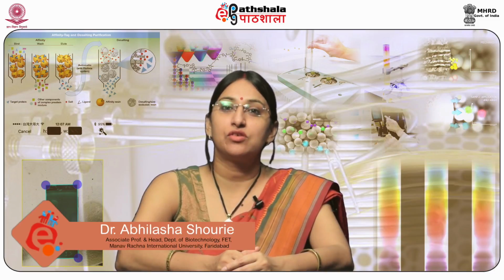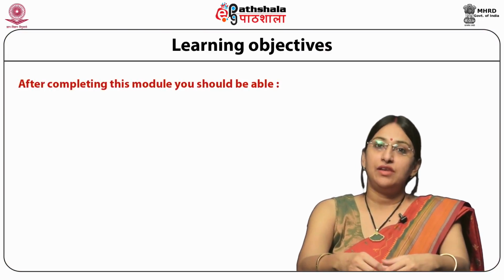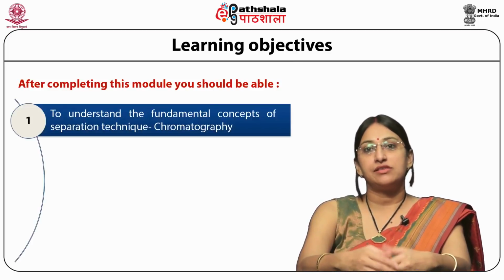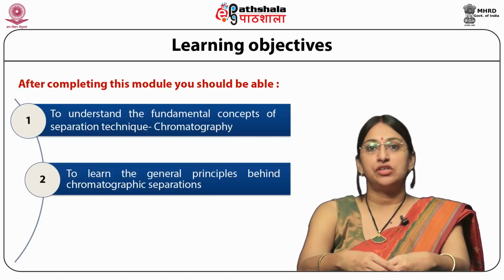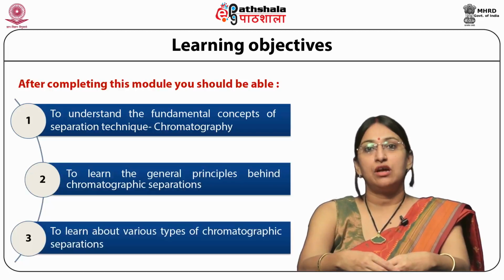Today we are going to talk on the module General Introduction to Chromatographic Techniques: Definition, Principle and Classification. This comes under the paper Chromatographic Techniques 2. After completing this module, you should be able to understand the fundamental concepts of separation technique, chromatography, to learn the general principles behind chromatographic separations, and to learn about various types of chromatographic separations.